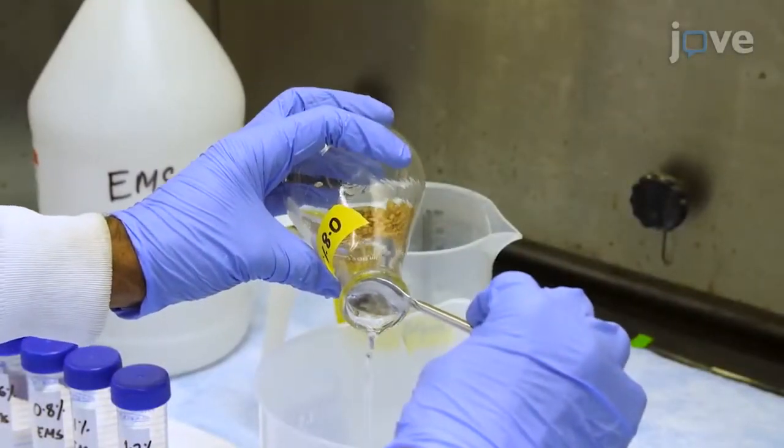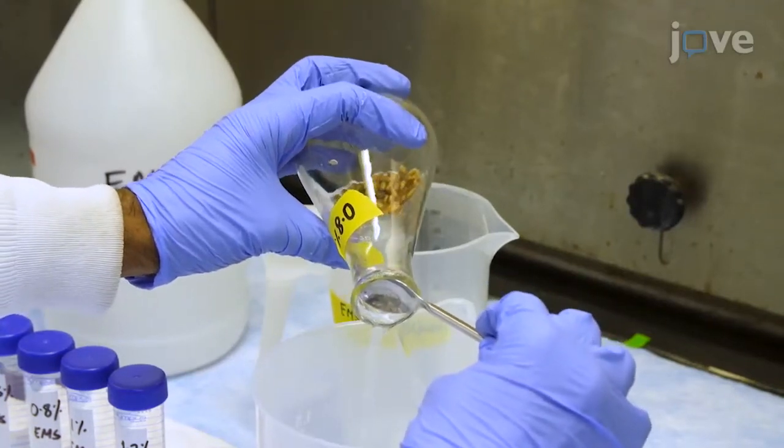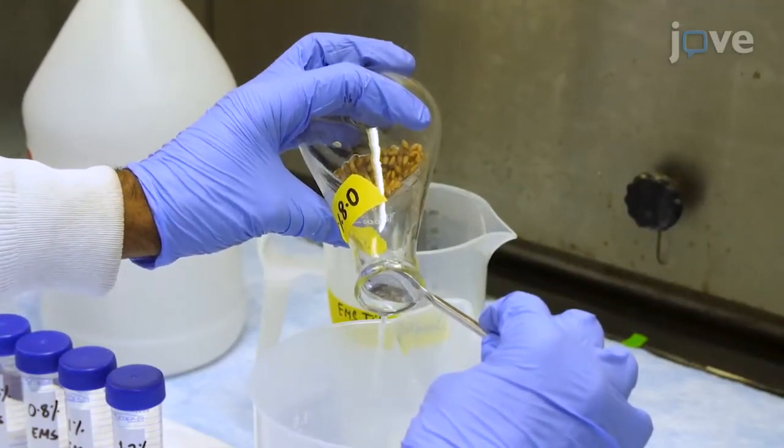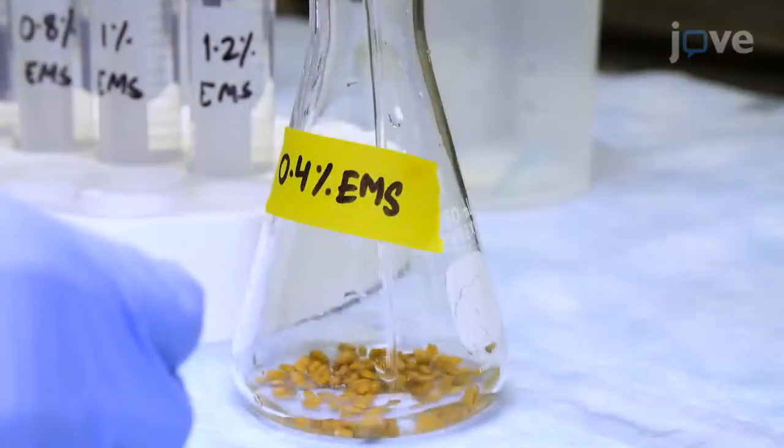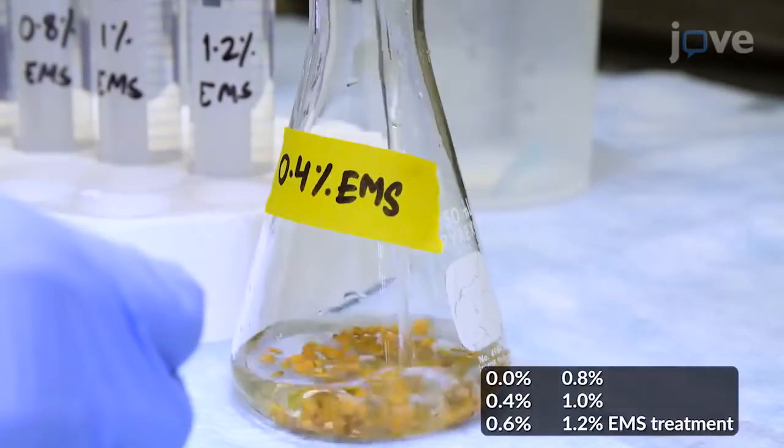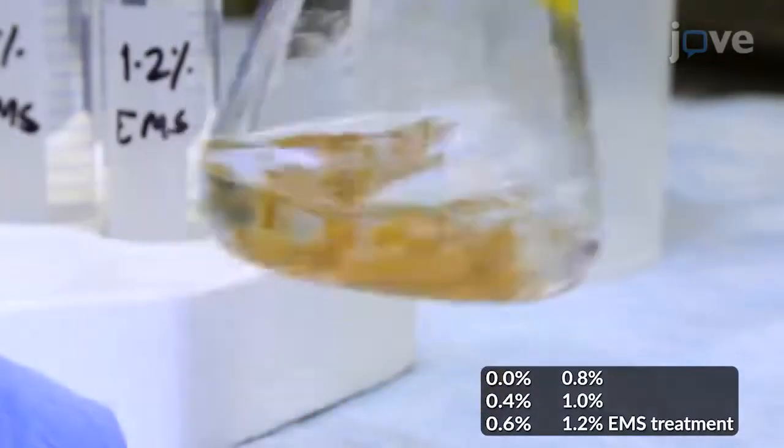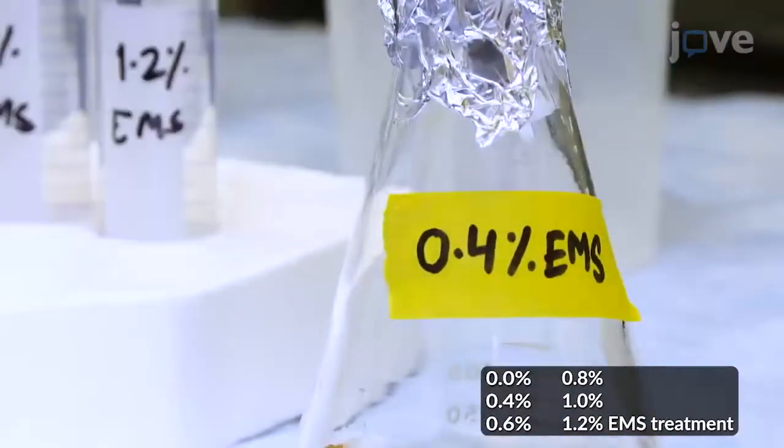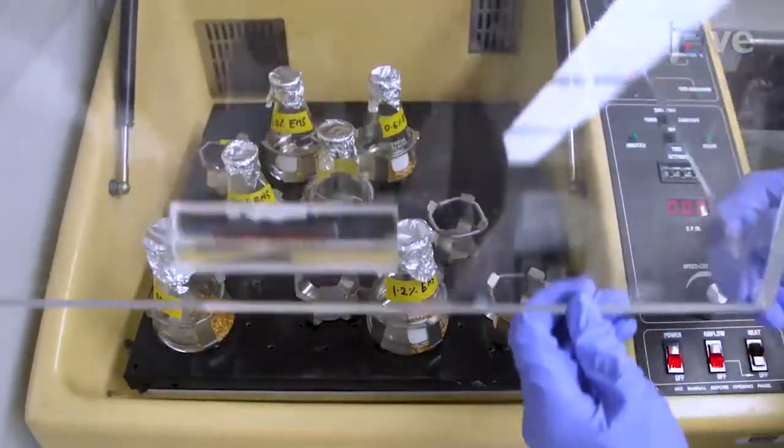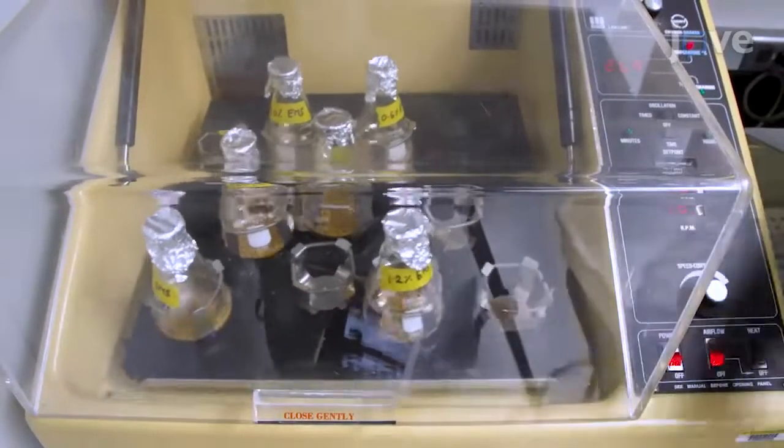After imbibition, decant the water out of 5 flasks. Add 50 milliliters of EMS solution in each of the 5 flasks containing imbibed seeds. Shake the flasks for 16 hours at 75 rpm and room temperature.